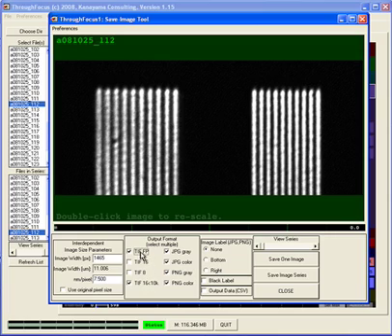If you want a floating point TIFF, these are good for getting the data into MATLAB and performing more analysis. I'm going to turn those off for now. If you want different JPEG or PNG, you just set these here. Let's get PNG, JPEG, and okay, TIFF floating point.